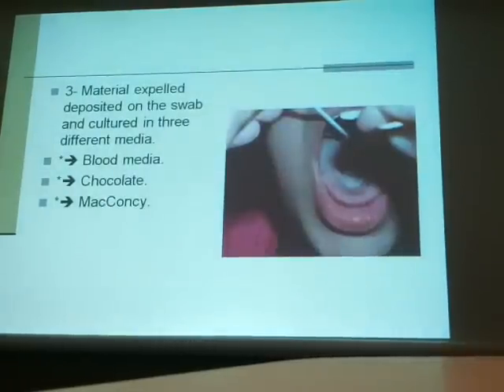So after collection of the sample, whether sputum or nasopharyngeal swab, we culture it like a throat swab on blood, chocolate and MacConkey agar, and we also use the streaking plate method. Before we culture it in this media, what do we usually do with the sputum? We centrifuge and use the sediment. We use the sediment for culturing and we also stain it before we culture it, by acid fast stain.